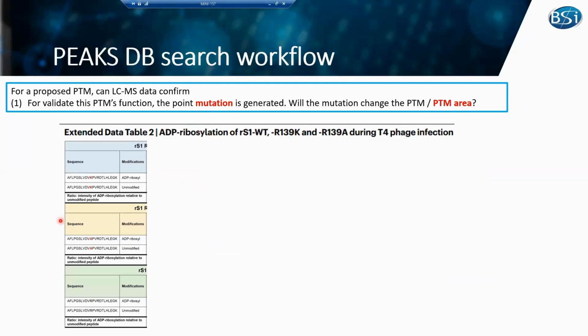And then after we confirm the PTM and the position, the other thing in the paper is that the author generated a mutated peptide sequence. So here they change the sequence, change the amino acid, to see how it will impact the PTM profiling.